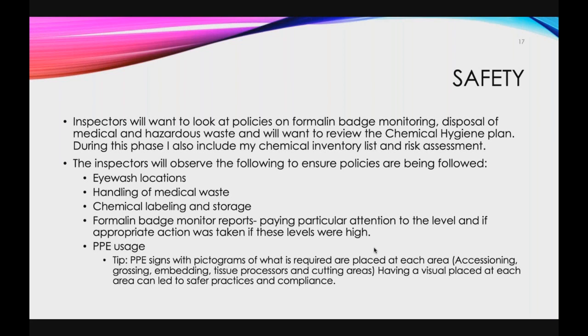This could be good and this could be bad. It's good because they can see what they should be wearing, but it also tells the inspector, it's easy for the inspector to see, okay, somebody's pouring out waste, but they're not wearing a face shield, and it's required. While it's easy for us to say, oh, the staff knows because look, it's printed.